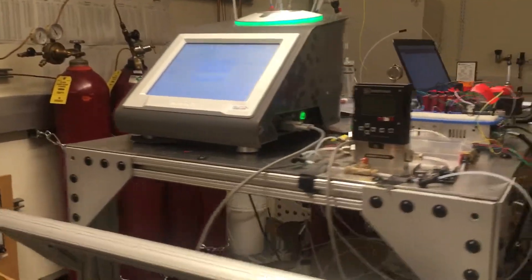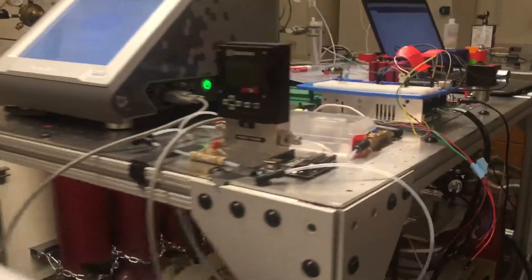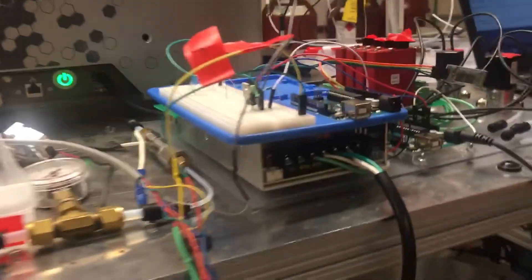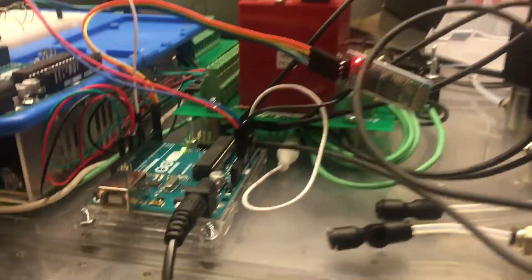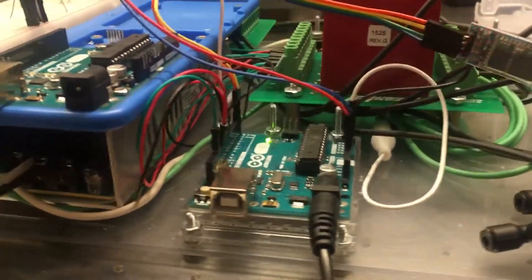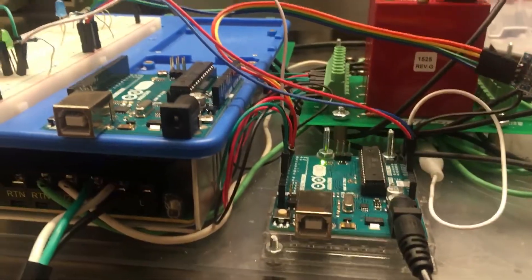Hey guys, so I hope you can hear me. What I'm going to do in this video is talk about the setup that we're using in the Pines Lab and how we've been updating it slowly over time.